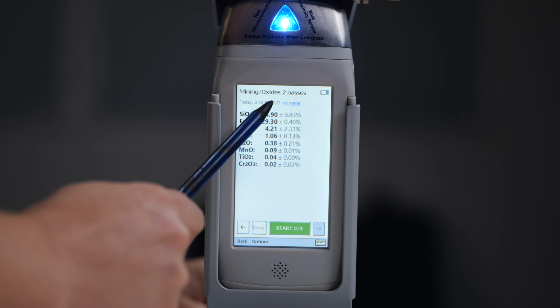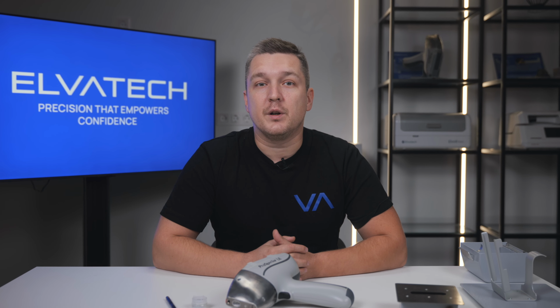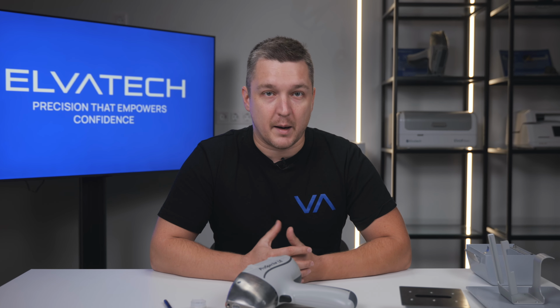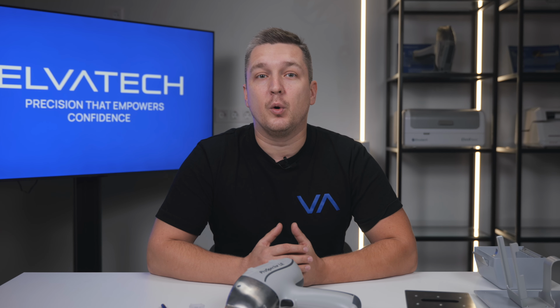In ProSpector 2, you can easily set the number of measurements to average, say 3, 5 or more. The feature is integrated into the software and doesn't require any complicated steps. You simply enable it and the instrument does all the calculations for you. Now I will show you in practice how this works.